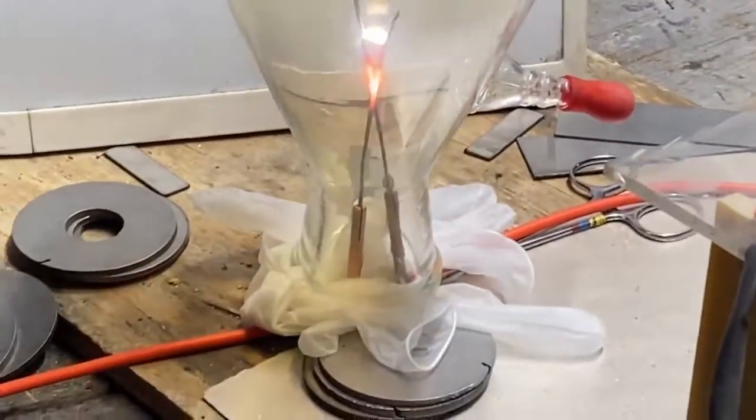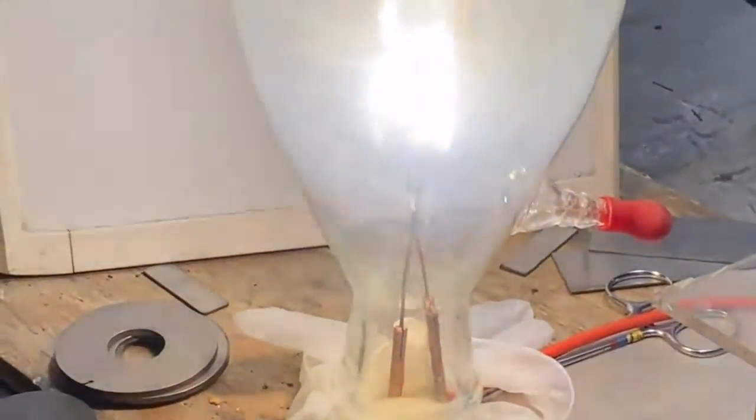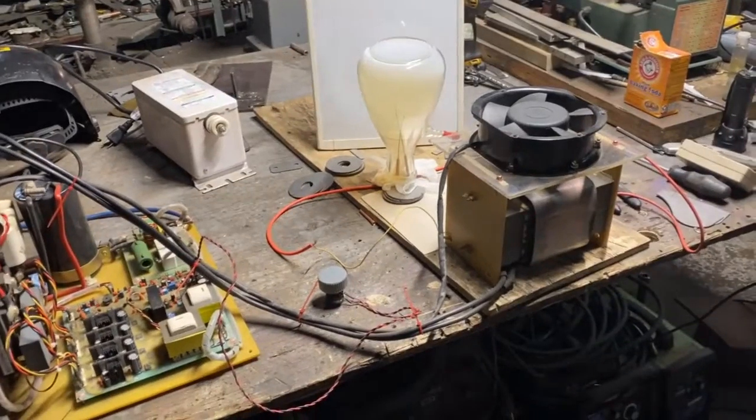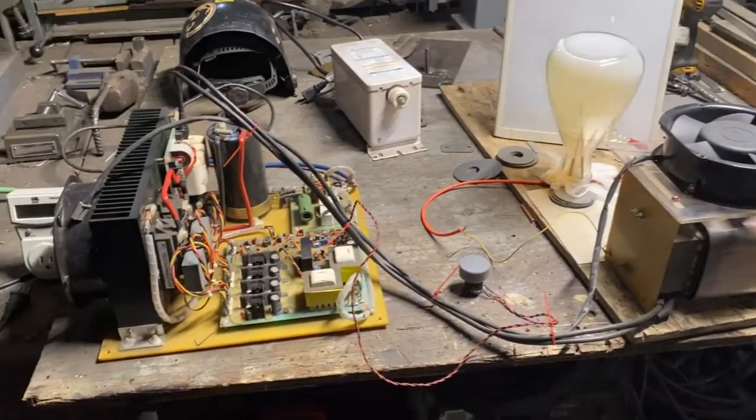It's gonna stick one of these times, I'm gonna be done for. Oh yeah, there it goes. It's cooking the freaking tungsten, I guarantee it. Once again we're gonna have to beef this down.